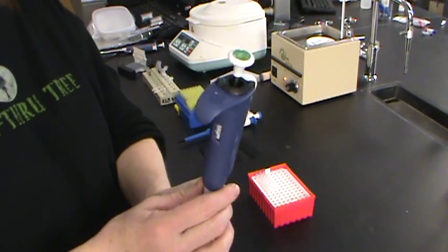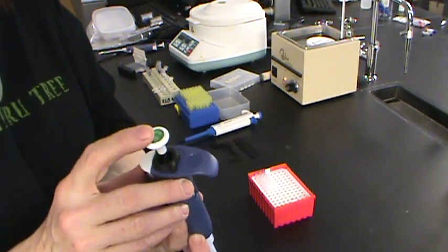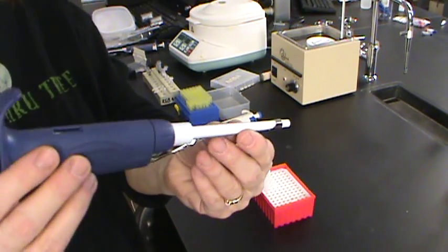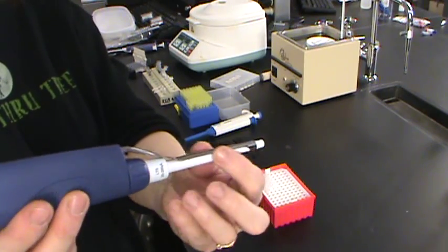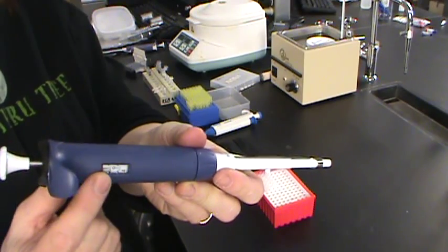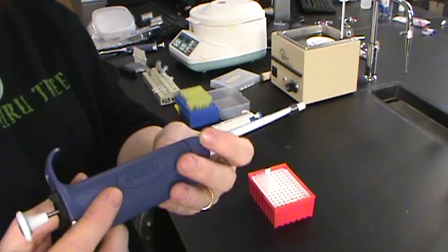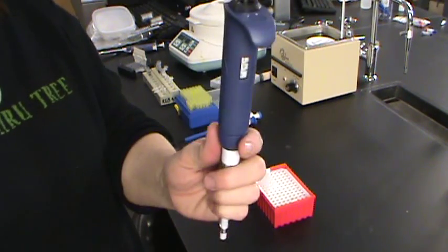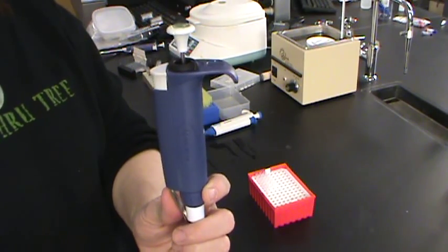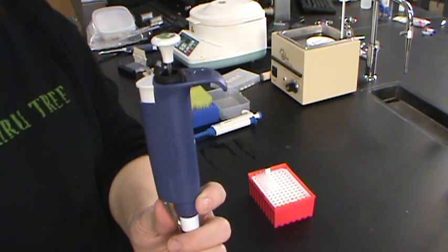Now, as we look at this Rainin pipetter, you're going to see a number of things on here. There is a plunger. We've got the shaft of the pipetter. We'll note the silver that's on here. There's a little window that indicates the volume that we're going to be pipetting, and that is in microliters. The type of pipetter that you'll have in lab is what's called an L200, and so it will measure the types of volumes that we need to use today.